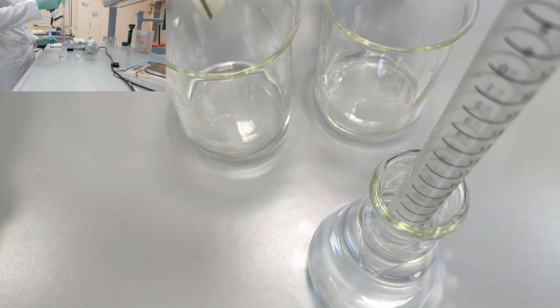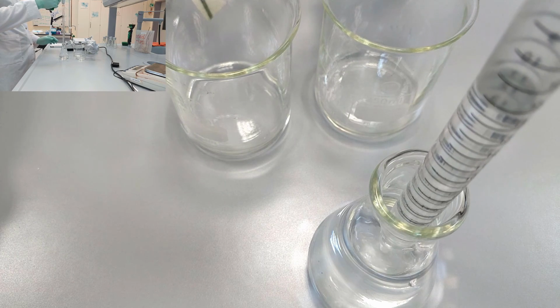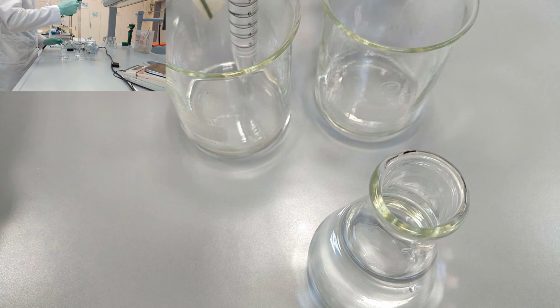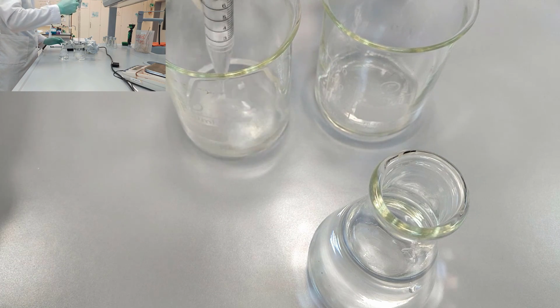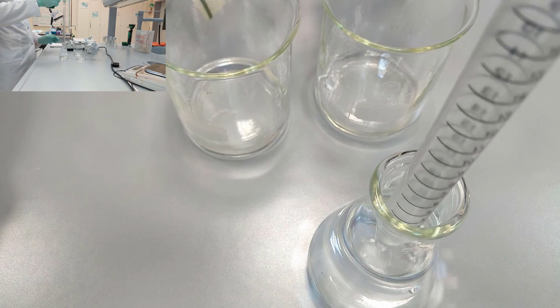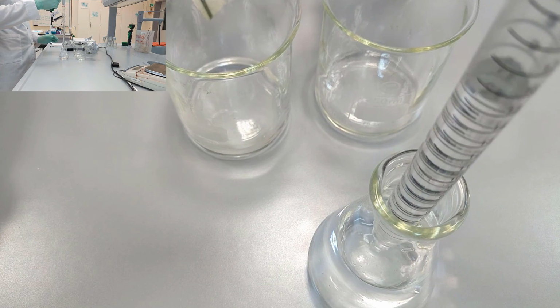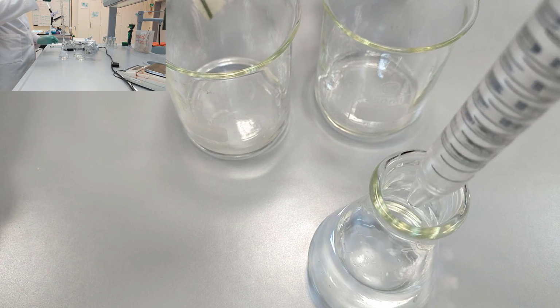So again, we need 15 milliliters to dilute the 1.2 molar solution to 0.8 molar solution. And we need 40 to dilute it to 0.4 solution. In this case, we take twice 20 milliliters.